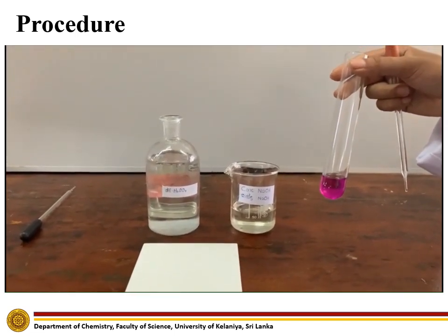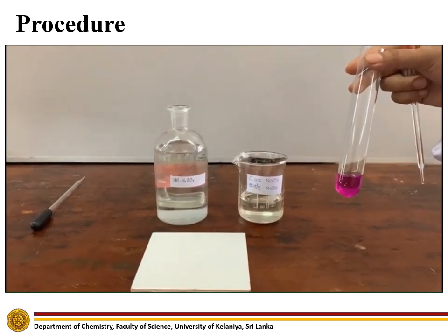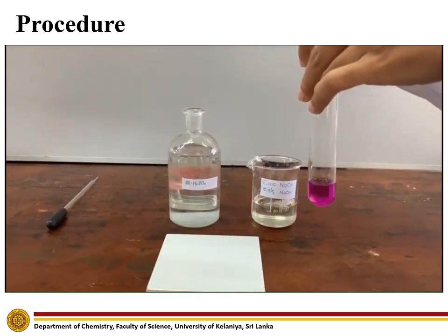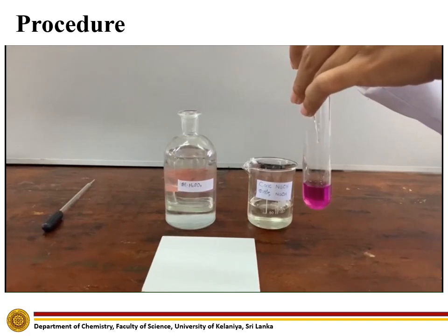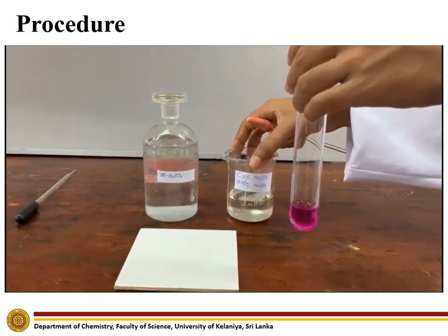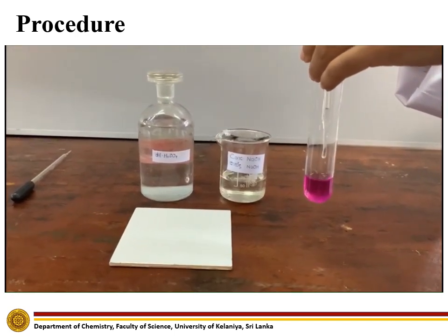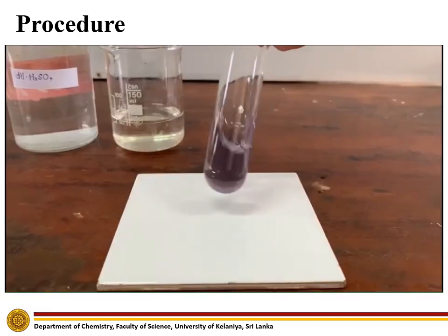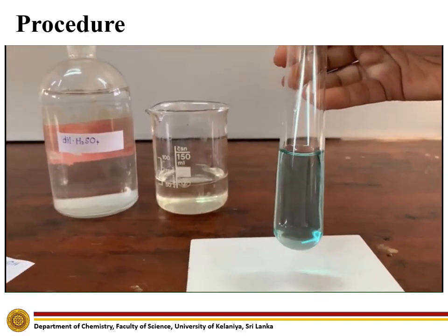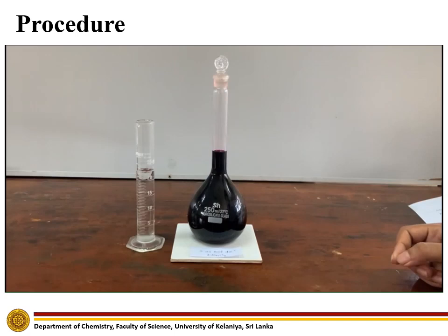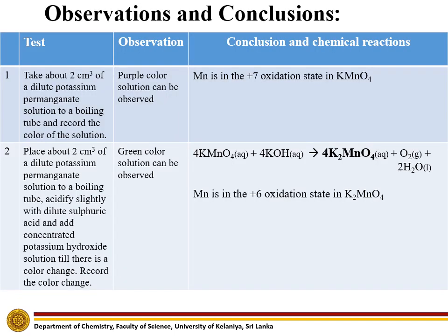As the second step, we are going to slightly acidify the prepared dilute potassium permanganate solution using a few drops of dilute sulphuric acid. Then add concentrated sodium hydroxide dropwise and observe the color change. A green color solution can be obtained. This green color solution indicates the +6 oxidation state of Manganese. The light purple color solution indicates the +7 oxidation state of Manganese.